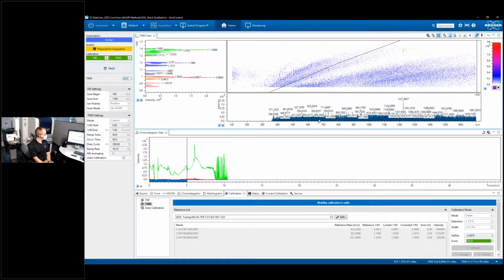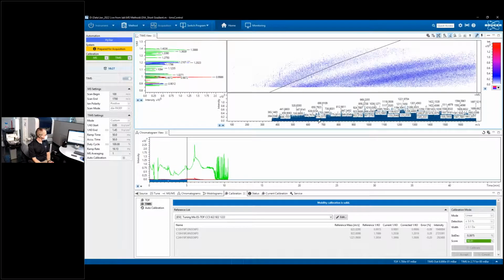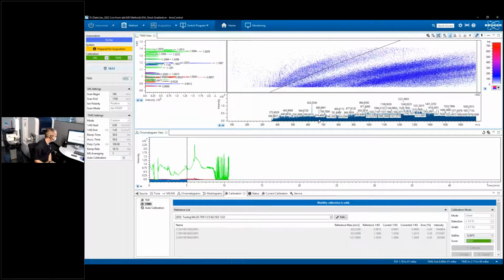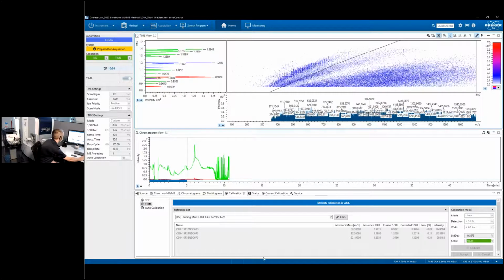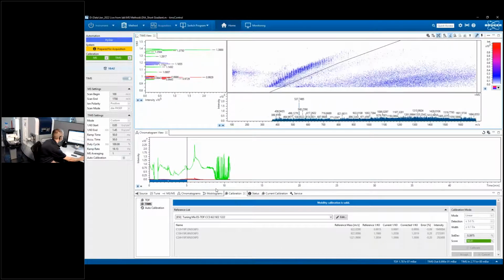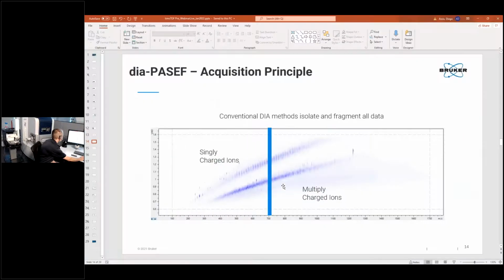Okay, a couple more things then. There was a good question here about setting it up, but I can't find it now. So we talked about the spectral library. Does the dia-PASEF fragmentation method start with the higher mass-to-charge values and go backwards to lower mass? It might be good to say again how in the DIA the ions are fed from the TIMS, and what it's doing. Great question again, absolutely.